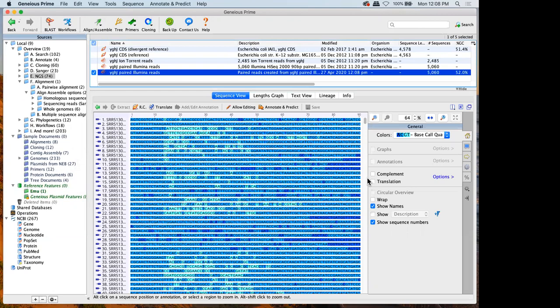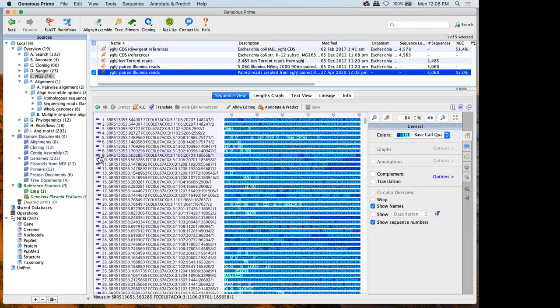So this is going to import my sequences. This is all of my raw reads. You'll notice to the left of my sequence name, there's a little blue icon. When I told Geneious it was paired data, it didn't really do anything with that. It hasn't merged reads or anything. It's just kept a note in the back of its mind: this is paired data. When I do my assemblies, I'll take advantage of that fact if it's available.